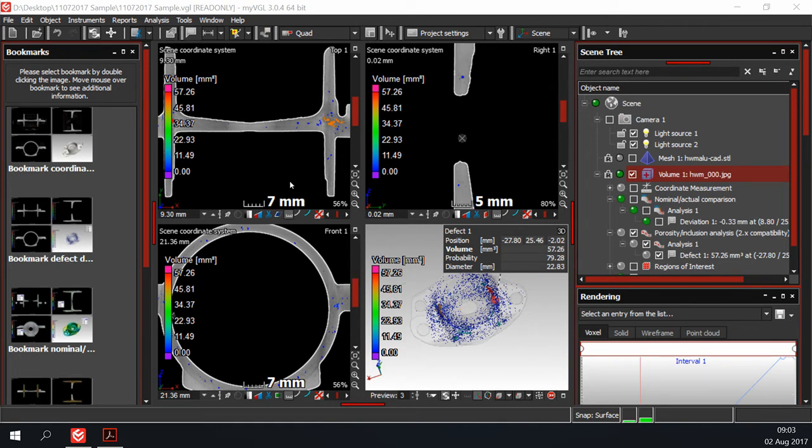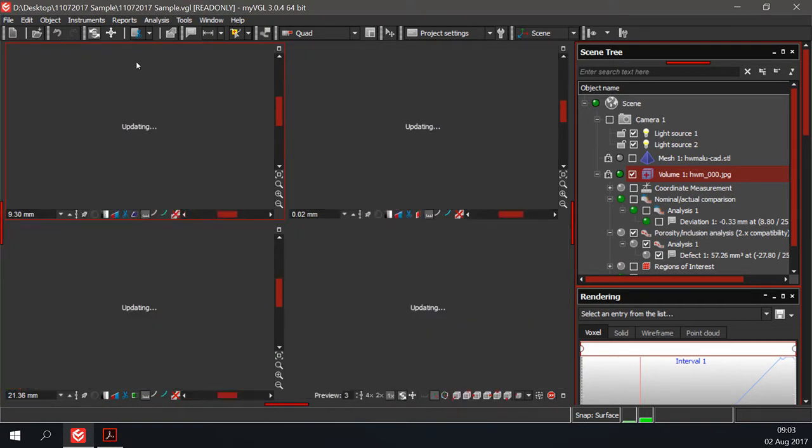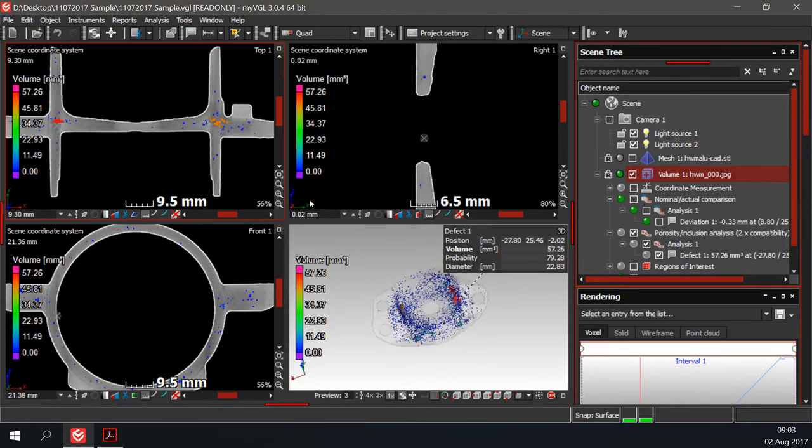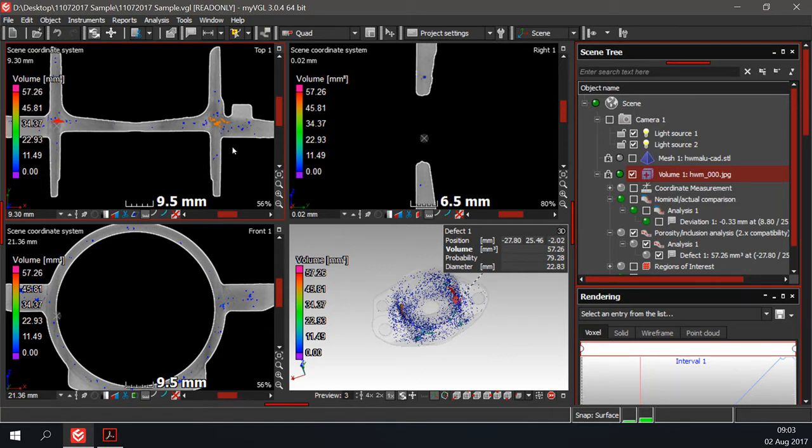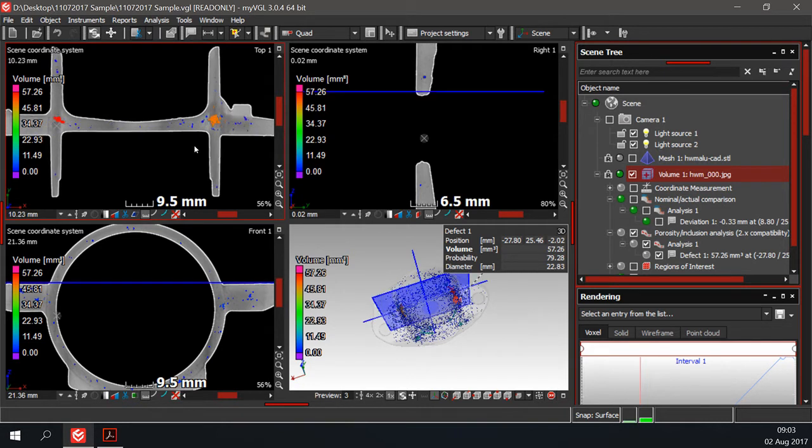To improve visibility I will close the bookmarks bar for now. When you hover your mouse cursor over any of the 2D views and scroll the mouse wheel, you will slice through the CT dataset.